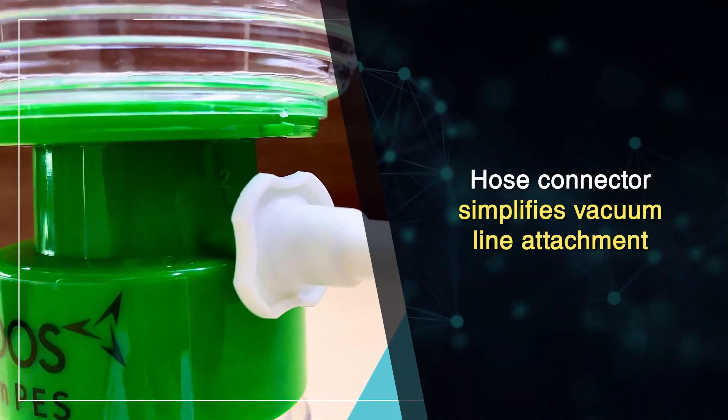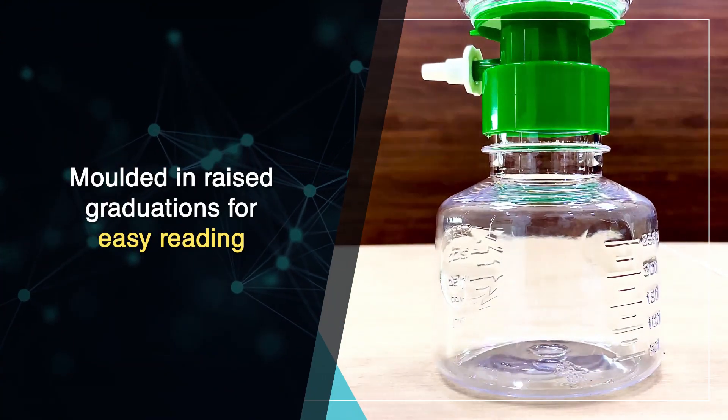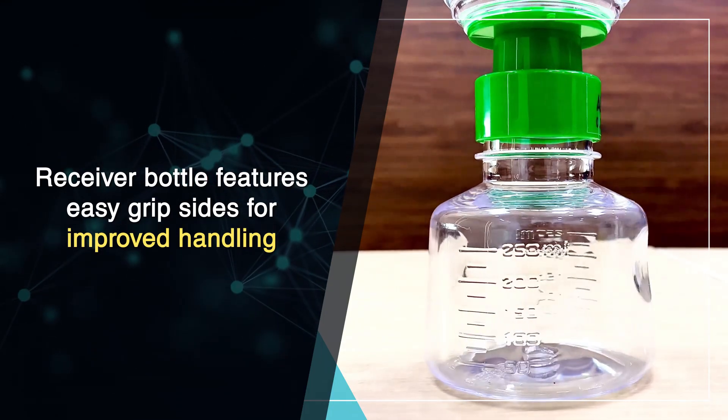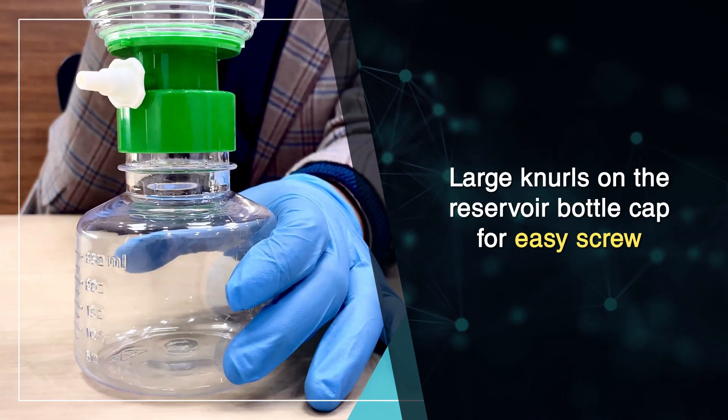The hose connector simplifies vacuum line attachment. Molded-in raised graduations allow easy reading. The receiver bottle features easy grip sides for improved handling, and large knurls on the reservoir bottle cap for easy screwing.